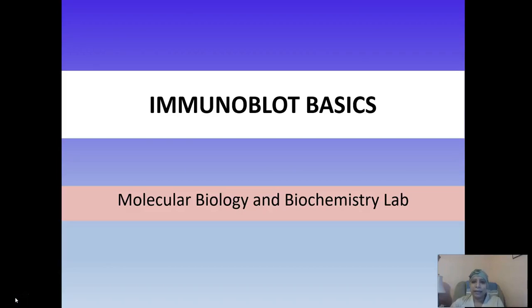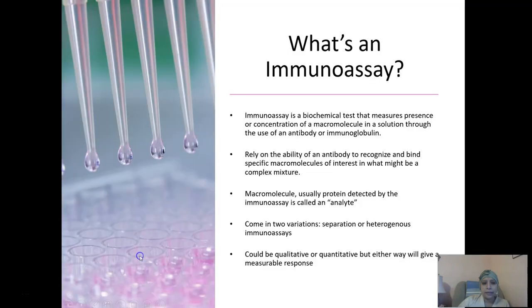Hello again. So today we are going to talk about another common molecular biology technique called Immunoblot. And we're going to talk about all kinds of different things associated. So first of all, let's talk about what an immunoassay is exactly.